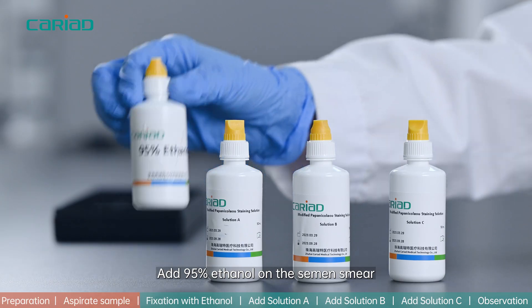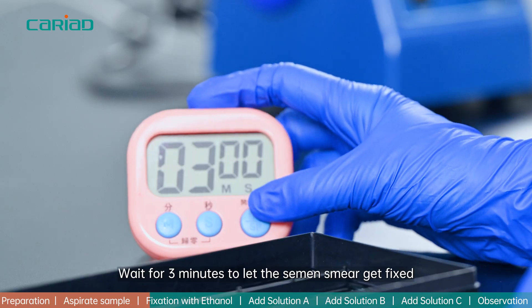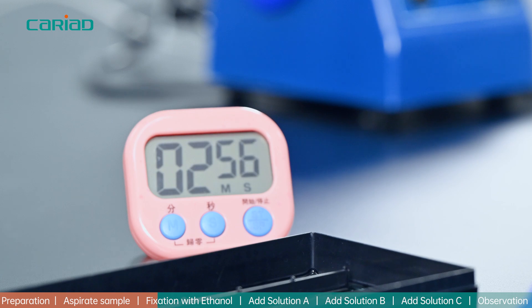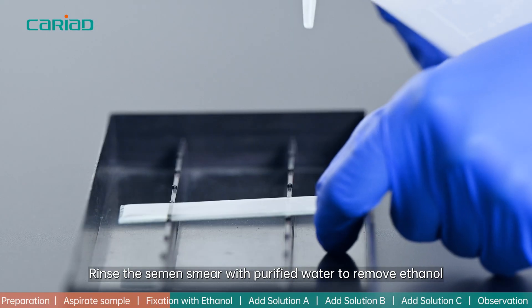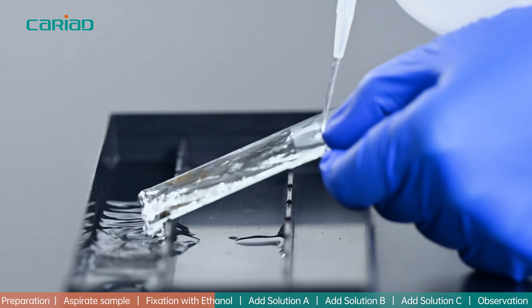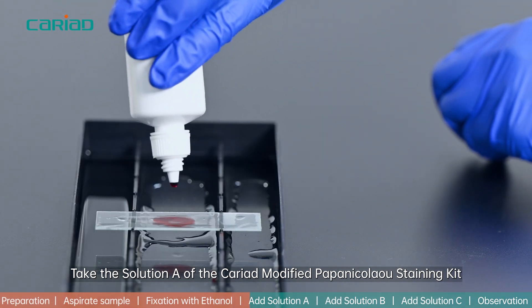Step 2: Add 95% ethanol on the semen smear and wait for 3 minutes to let the semen smear get fixed. Then rinse the semen smear with purified water to remove the ethanol.